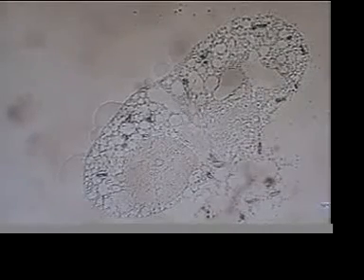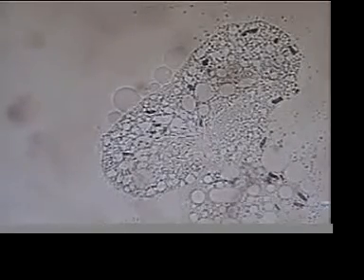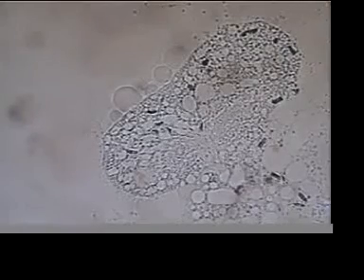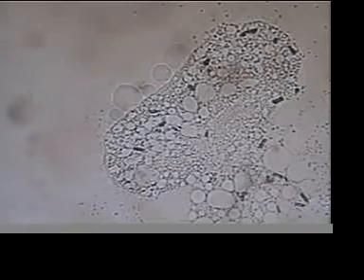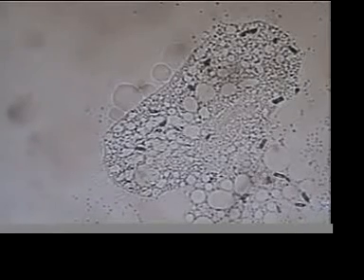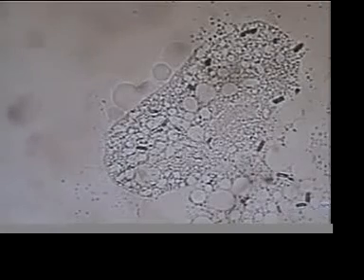And he is completely devitalizing in real time. Completely destroyed in a very dramatic way here. Look at that. Notice the spheres forming. Paramecium undergoing complete, utter, total destruction.